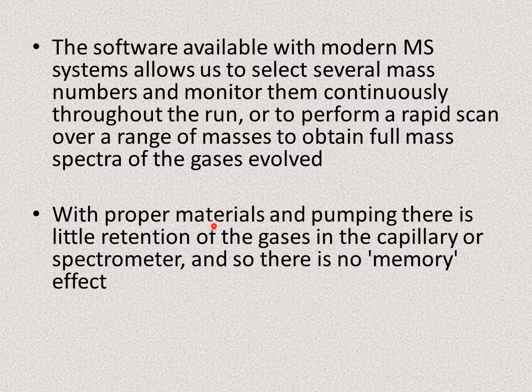With proper materials and pumping, there is little retention of gases in the capillary. So if the system and pumping are proper, there are no chances of retention of gases in the capillary or in the spectrometer, and hence no chances of a memory effect, which may cause errors in results. So errors in this way can be avoided as well.